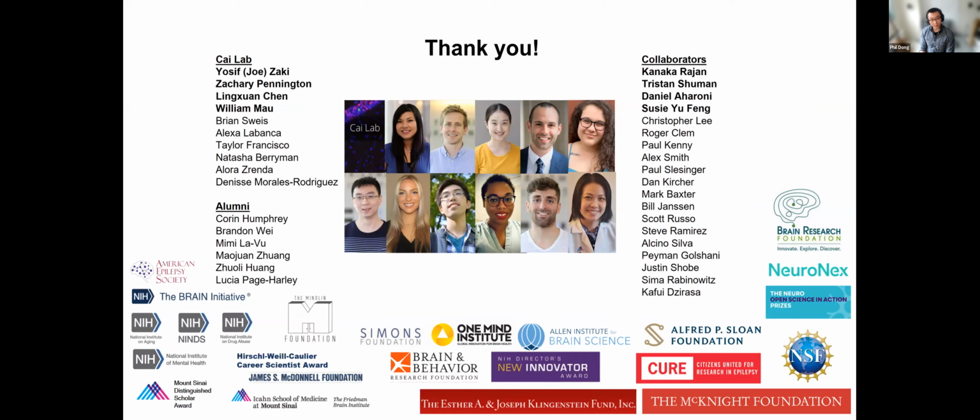Dark spot. I would say it's probably very hard to recover the information that's hidden behind the dark spot. So I guess those will just be lost, in Minian certainly. I think this question was also partly about motion correction: if you have dark spots that are stable relative to the pixels and grain that moves, how do you deal with that? Yes. So that's the only thing I can think of to sort of deal with it.